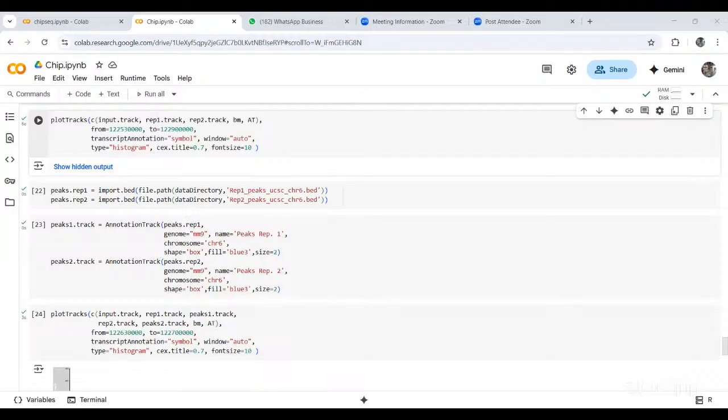There are many algorithms and tools for peak finding. I already showed you in the two or three classes before. The choice of this method is strongly motivated by the kind of factor analyzed. Other things you can read on your own; it is given quite nicely. So now we will go ahead with the identification of the peaks.